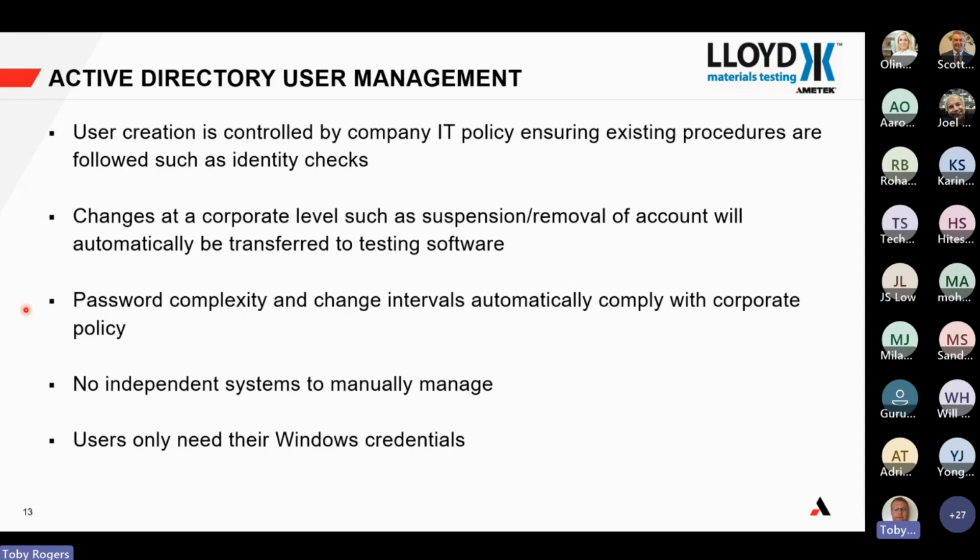Key part of the FDA regulations is looking at password complexity and change intervals, and they really relate to electronic signatures, which are typically a username and password. And rather than configuring this independently in an independent system in the lab, if we use Active Directory, then we're linking into whatever your current corporate or organization password policy is. So it saves a lot of time.